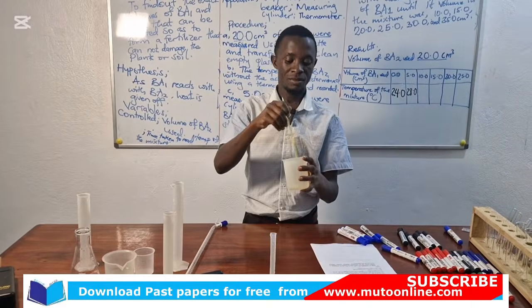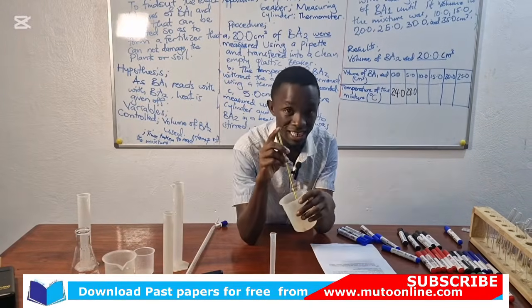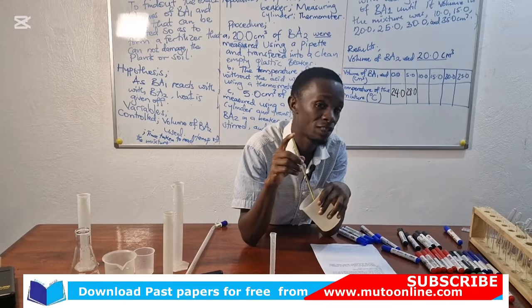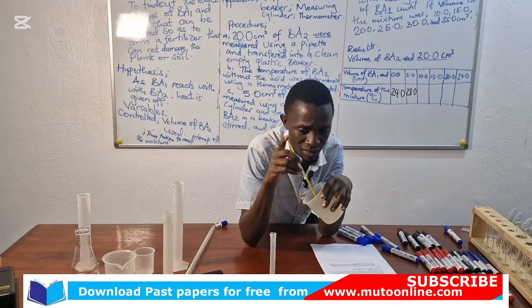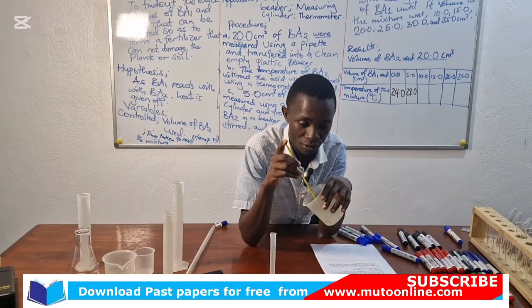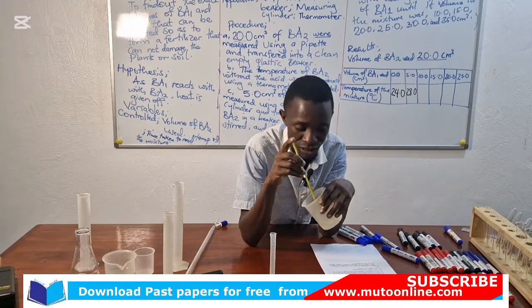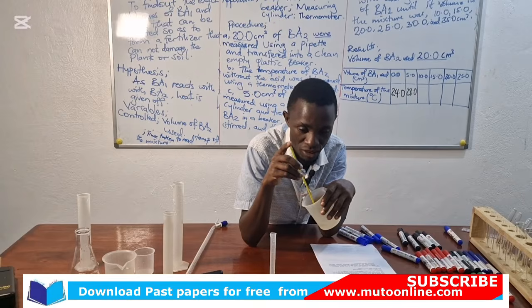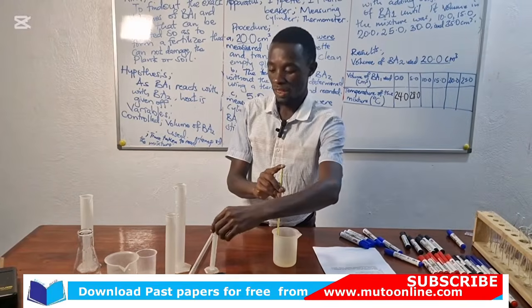Stir. Start your stopwatch. Make sure that the time you take to record the temperature is the same time you took before recording the previous temperature. I'll give it time for the reaction to proceed, and then I'll be reading the new temperature. The new temperature reading here is 30.